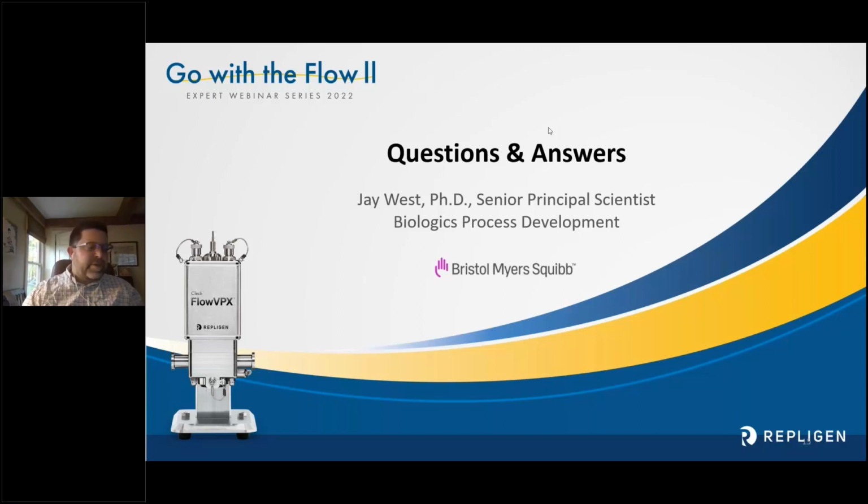So what that means is that they have to add this step, which takes several hours and requires an offline 4 to 6 hour A280 measurement half the time. So basically, half the time they have to add half a day. So I hope that answers the question. But basically, it's saved about half a day on average for the pilot scale.